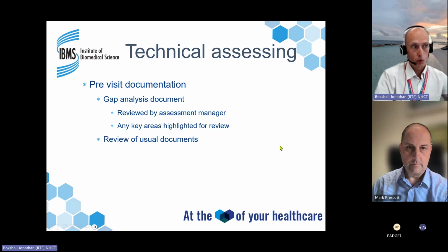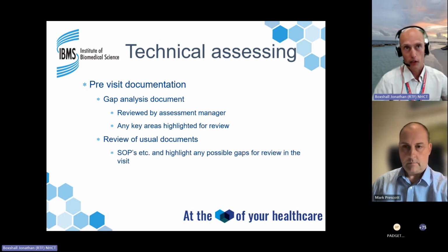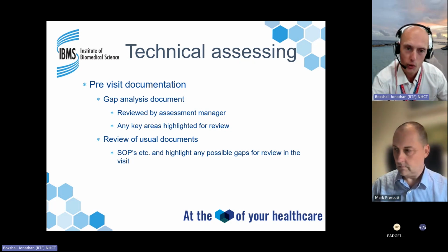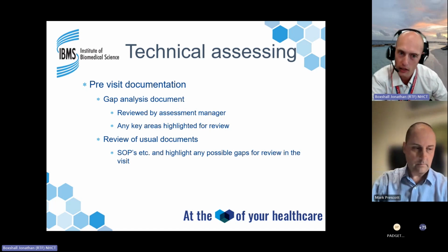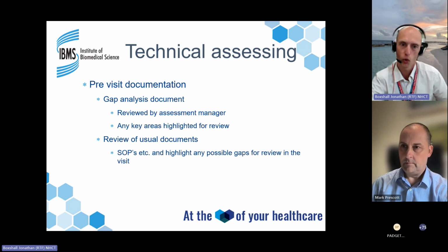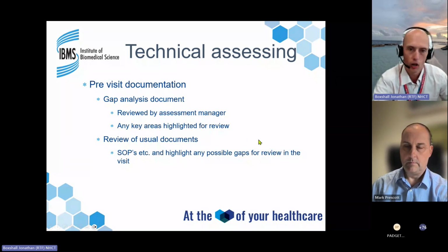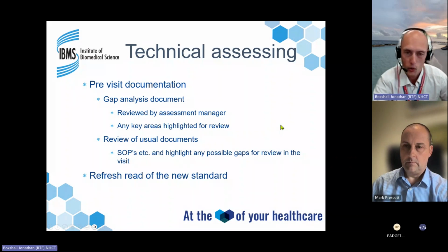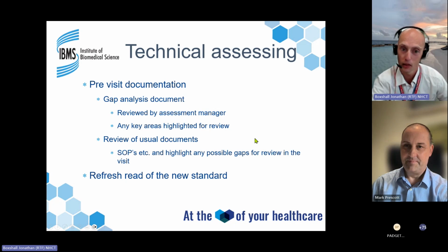So we do all that, do the usual review of documents, and that's all the SOPs, etc. So we still do that. That's all part of your normal standard assessment. So I usually will read everything and probably be coming into the laboratory with a few questions before we even start. So I already have a good idea of what I need to be looking at as part of whatever the scope has been applied to. And of course, I'll always do a quick refresh, reread of the standard, because I by no means know this standard backwards, forwards. And I think with everything, it's always really difficult to be able to learn it.